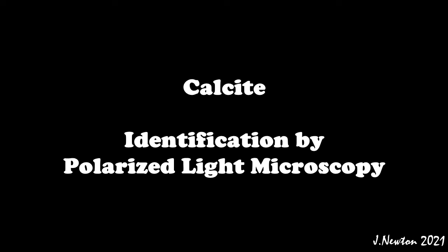Welcome to a brief tutorial on how to identify calcite using the polarized light microscope.